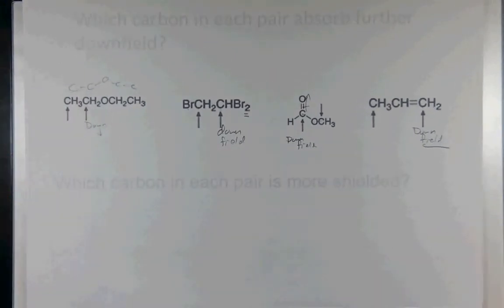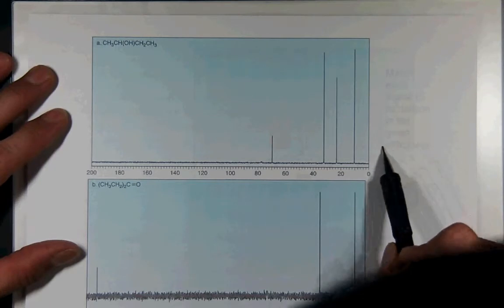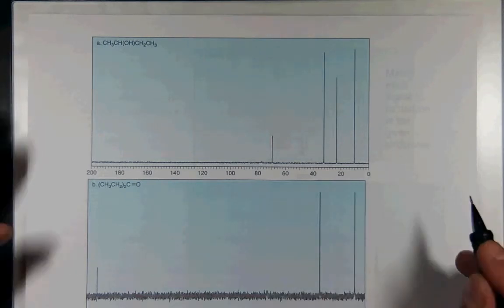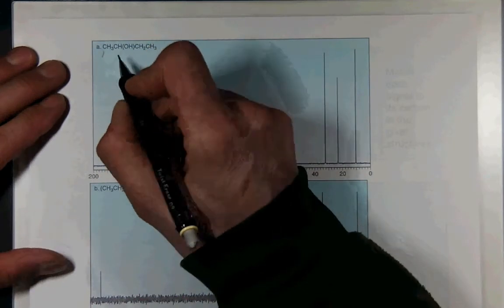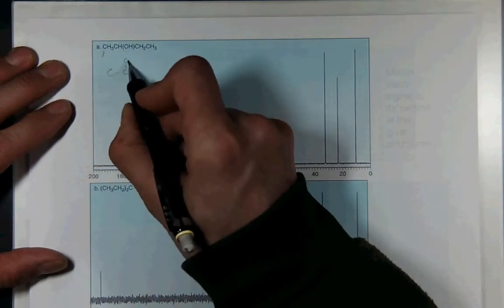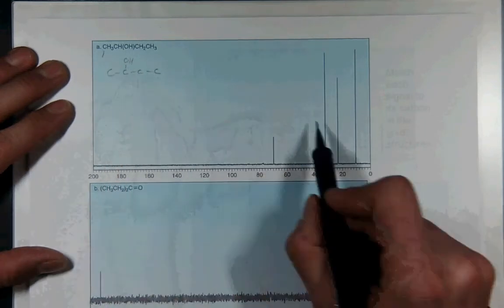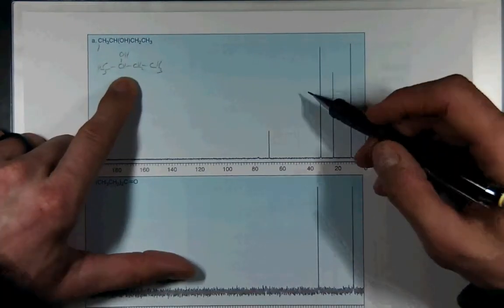And of course, if you're taking this course online, you have access to your book and your notes, and I don't know what I did with that table, but that table of chemical shift values for carbon 13 NMR is available to you. And here it says match, if you can read that, match each signal to its carbon in the given structures. Okay, so let's just label these. So it's 1, 2, alcohol group, 3, 4. So 4 signals, 4 unique carbons, right? 1, 2, 3, 4.